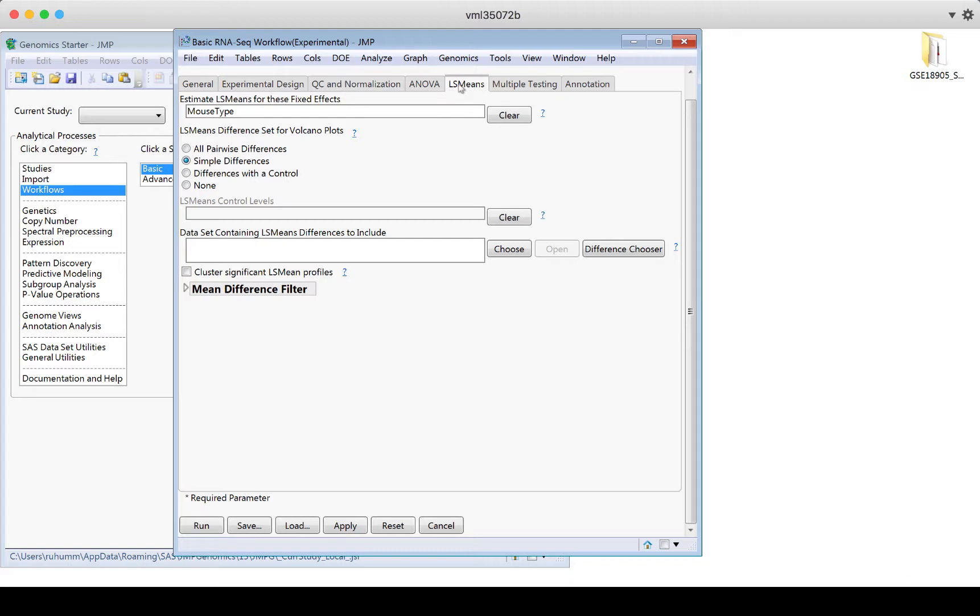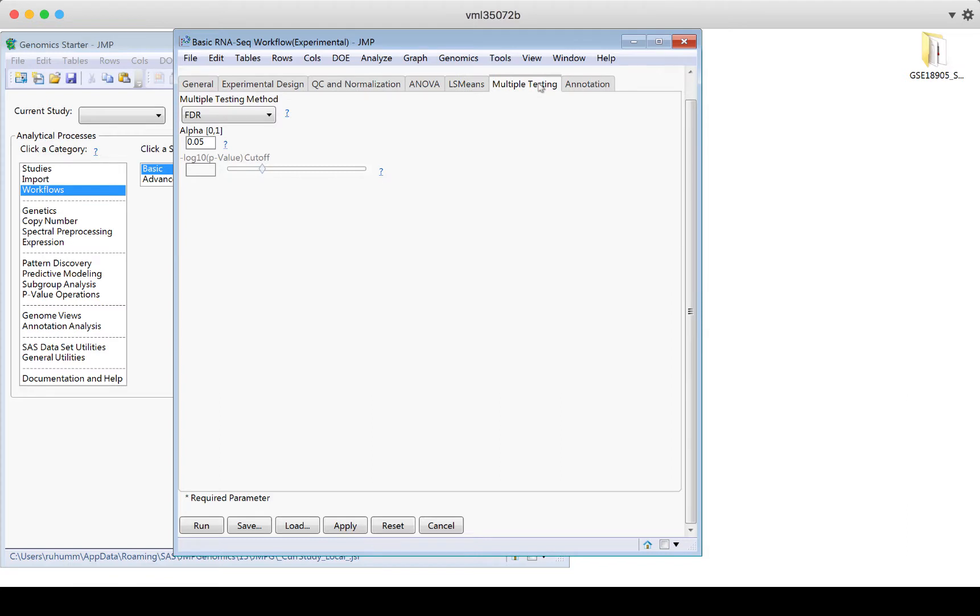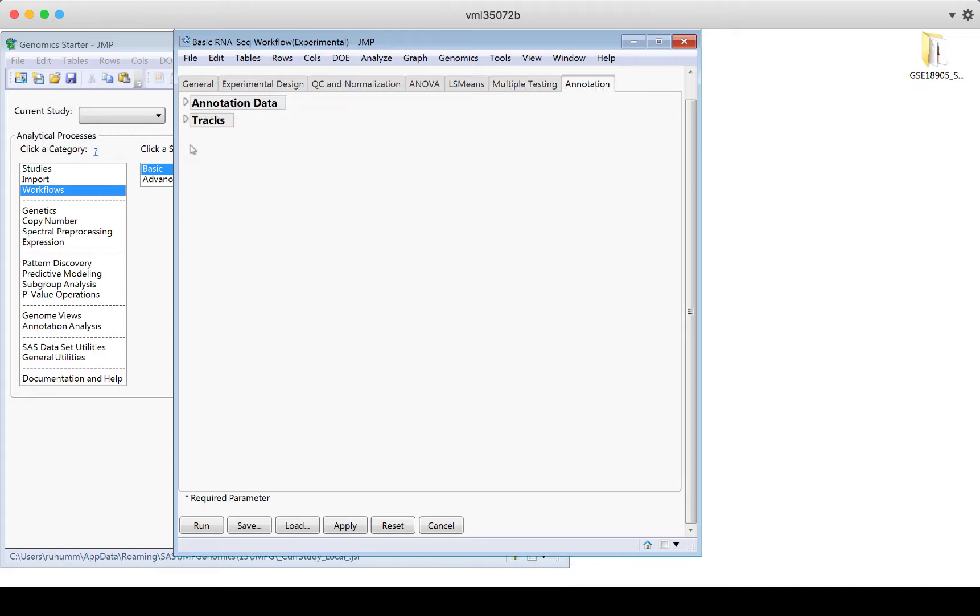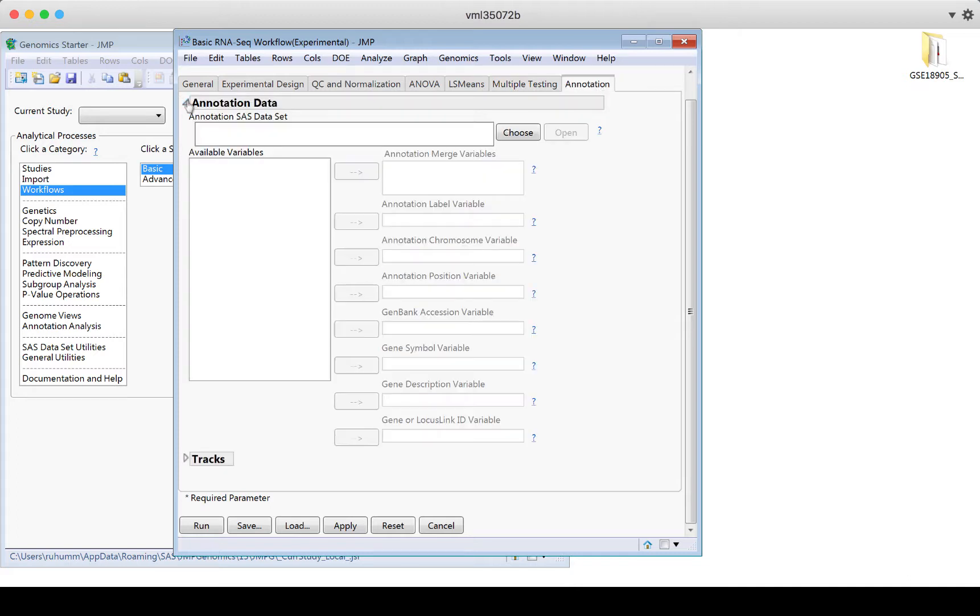When I go to the LS means, this is where I would look at differences. If I do find that the groups differ from each other, which groups differ? I can do all pairwise differences, simple differences, differences with a control. Again, use question marks to learn more. I can go then to the multiple testing tab. I'll use the false discovery rate as my method with an overall alpha of 0.05. And then annotation at the end.